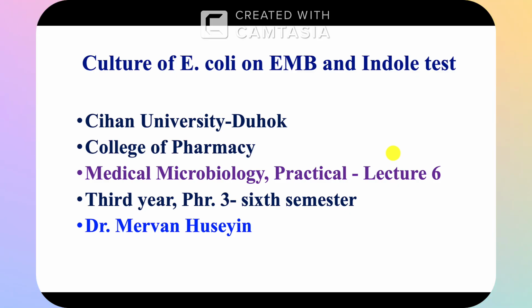I am Dr. Marwan Hussain, and I'm going to present the culture of E. coli, Escherichia coli, on EMB and the indole biochemical test.